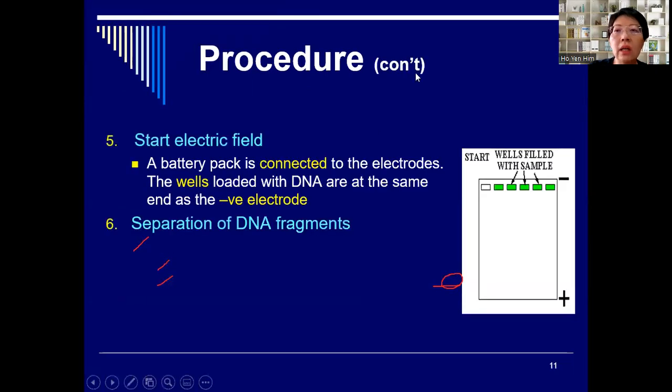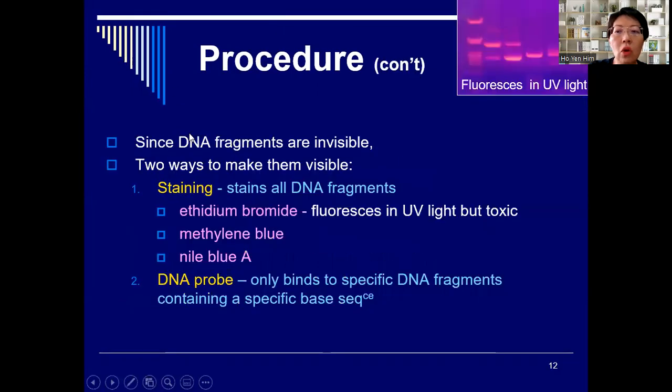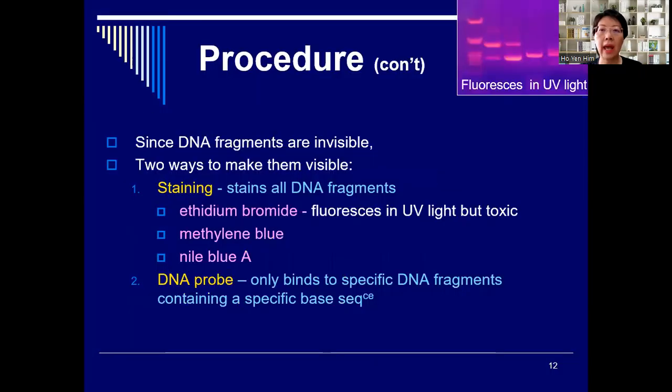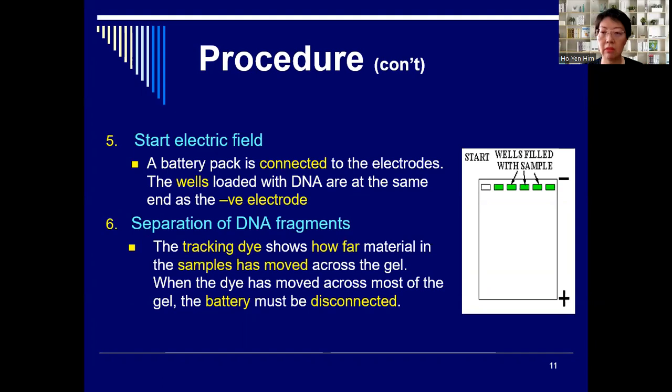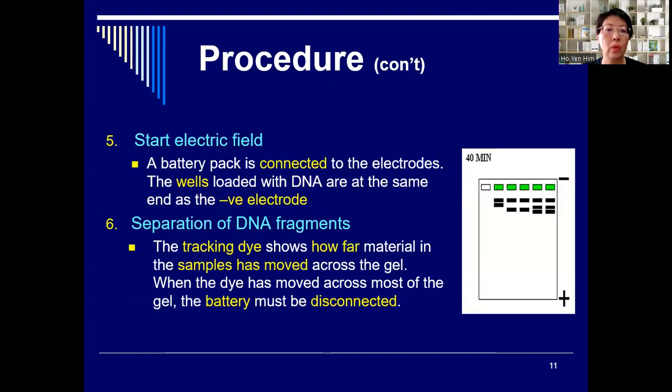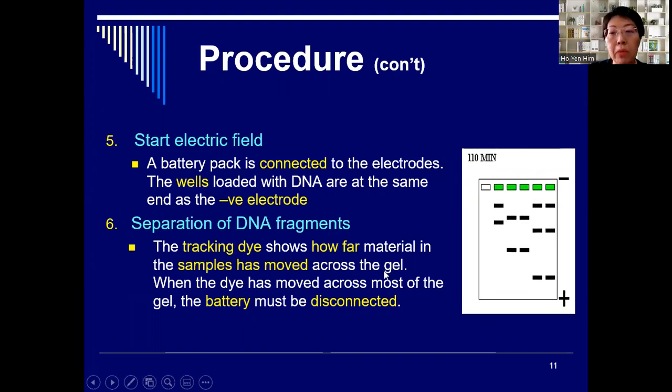These are all the information I have gone through with you already. Okay, so the next step. Once the DNA has been separated, once you finish gel electrophoresis, the last step is we have to locate where all the DNA fragments have separated.